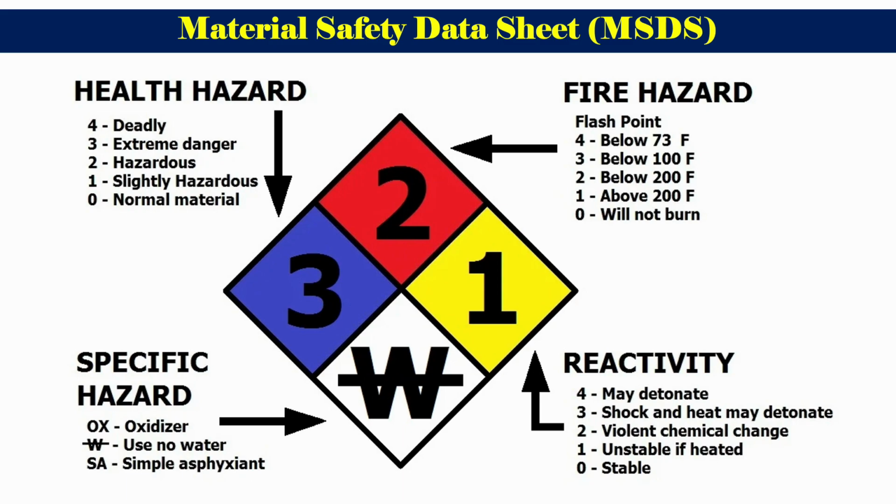These are called simple asphyxiants and can thus cause oxygen deprivation in those who are exposed, leading to unconsciousness as well as death. So this type of material should always be marked very clearly.